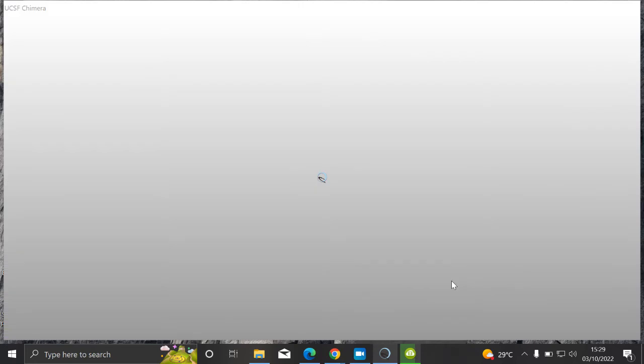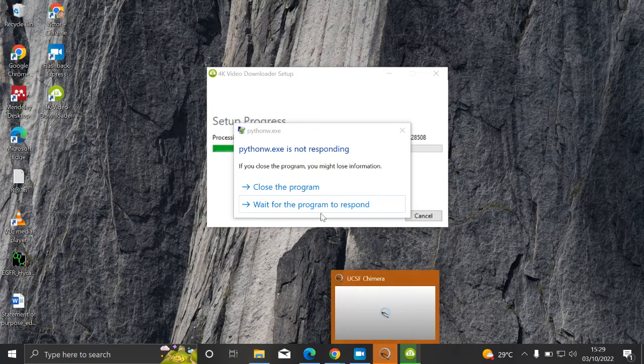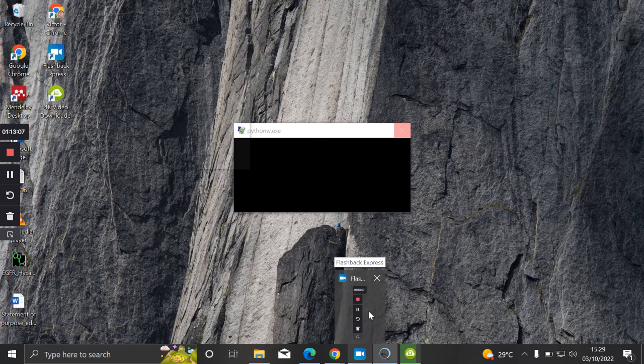So the first thing I will do is bring in my macromolecule, which is the SGLT2, that is responsible for the reabsorption of glucose in the kidney. And because it is responsible for the reabsorption of glucose in the kidney, there is need for us to find compounds or small molecules that are able to inhibit the function of this protein.